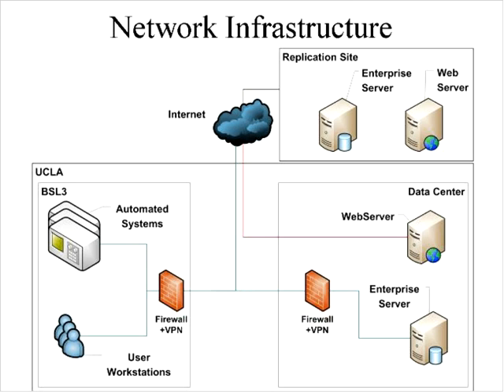Another thing that I wanted to emphasize that's a core concept behind this is that we do have a backup system. So we have a replication site off campus that allows us to have a complete backup. That's important for two reasons. One is the standard reason that you always want to have a complete backup of your system. The other core part of this is that this is really a demonstration project where we see this as a laboratory that would be networked not only to other high throughput screening laboratories in the future, but hopefully also to other collaborators as well. And so building the infrastructure for the replication site allows us to build in those modules that are necessary for secure communication with external clients as well.